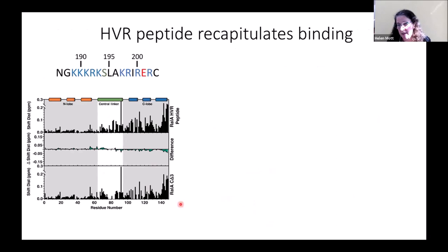We crystallized it. We got a crystal structure. The structure only had calmodulin and we couldn't see the peptide. So we obviously then decided to solve the NMR structure. When we started to work with this, we were just using synthetic unlabeled peptide. And what we found was that when we did the double-resonance experiments, the amide peaks from the peptide were so very broadened, we just couldn't really assign anything. So in the end, we realized we were going to have to label the peptide as well.